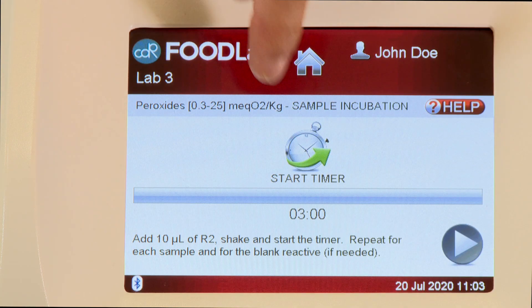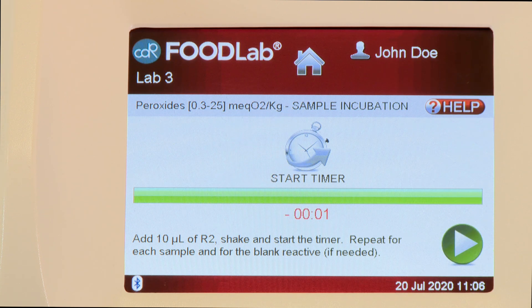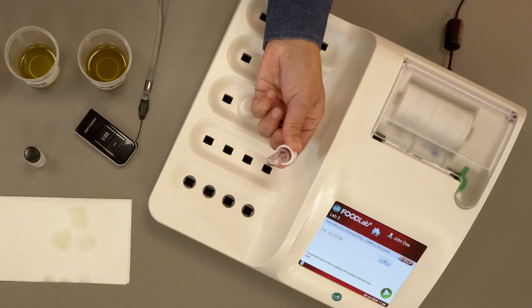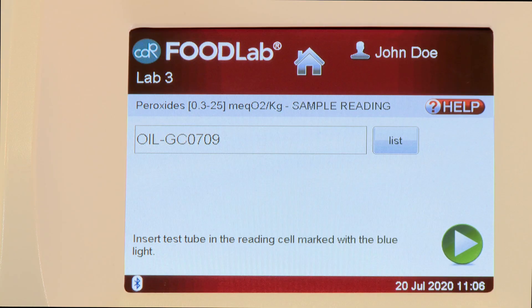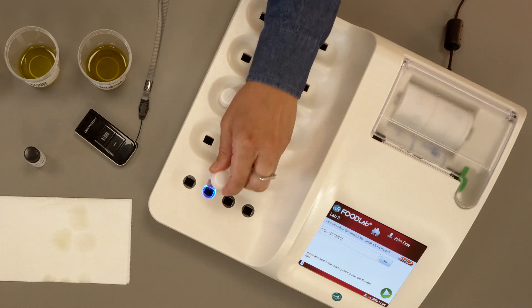Then press Start to start the timer. At the end of three minutes of incubation, press Next. Pull out the first test tube and place it in the reading cell indicated by the blue light. Then press Next to start the photometric reading. At the end of the reading, place the test tube back in the incubation cell. Repeat the procedure for all other remaining samples.